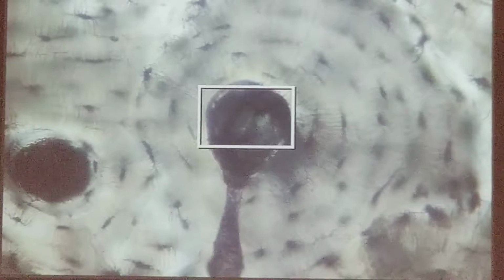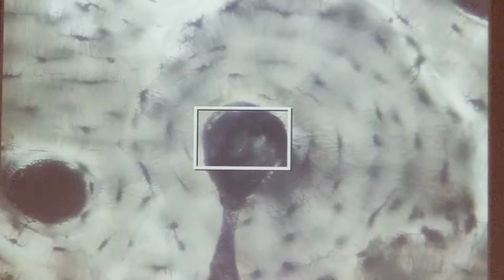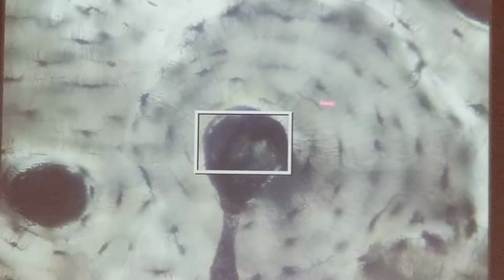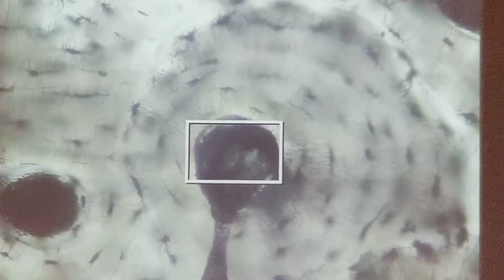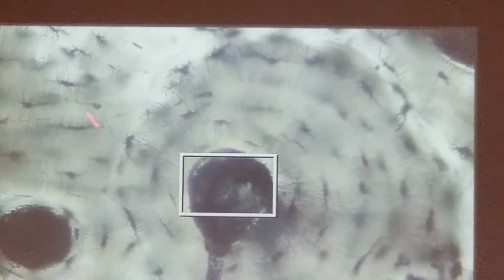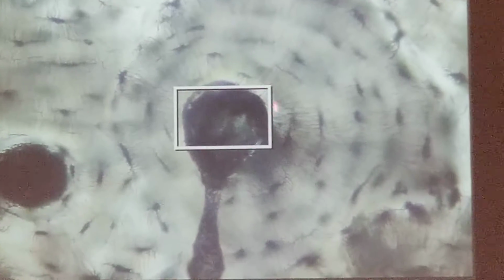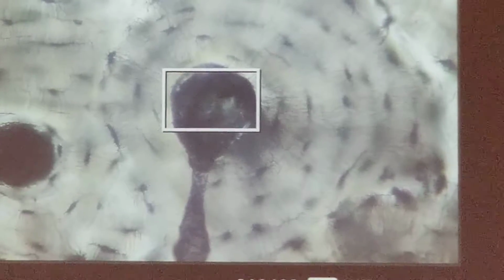Okay. The calcium phosphate is the ground substance, if you want to write that down. It's what we think of as bone, the white part of bone. So all this here that's white, even the background of what this is all in, that's the bone itself. Okay, that's calcium phosphate. And then in each one of these, right in the center where the box is, that's the central canal. We've got arteries, veins, nerves, look at it, goes through there. And then the lamellae are each one of these rings. So here's the inside ring, here's the next ring here, here's the next ring here, next ring there. Okay. So that's the lamellae.